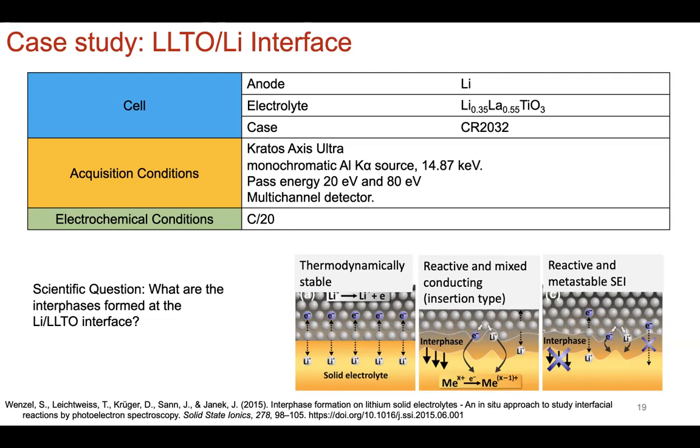As in, is it just going to be a decomposition, and then your solid electrolyte interface will form, and the SEI may or may not be useful for you, as in it might be ionically conductive, it might not be, it might be electronically conductive, it might not be, it could be mixed. Surprise, it is. It's mixed. The punchline is that it is. Or it can form some metastable SEI. And so we can detect that with this study.